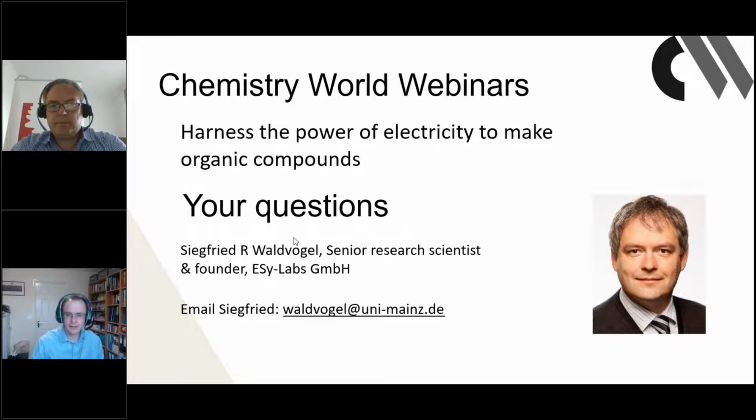Okay, that's a great answer. And we've got another question from Mikhail, who says it might be a silly question, but there are no silly questions in my experience in these kind of things. Why do you always use a DC current? Would there be any situation where you might use an alternating current? Presumably that kind of depends on whether there's any difference in the two electrode materials.